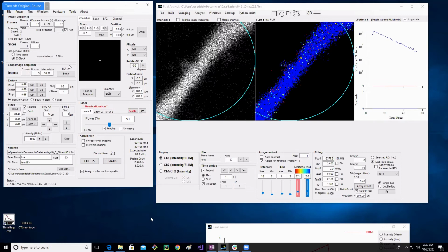Also, if you were working on the computer with different sequences, you can save. Let's say you set up averaging these frames, and you wanted to do a complex timeline series or something, you can save whatever your settings are here. Just do save settings as, and then load scan parameters. That's really helpful because you don't have to always reset everything up. You can just save your settings.